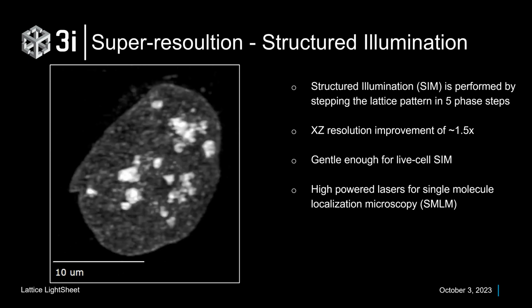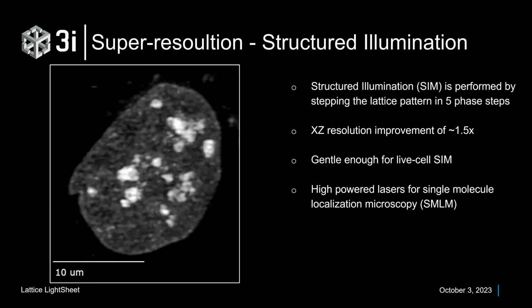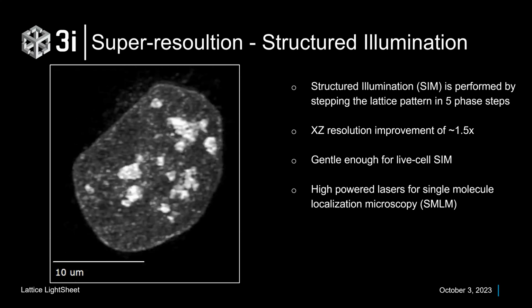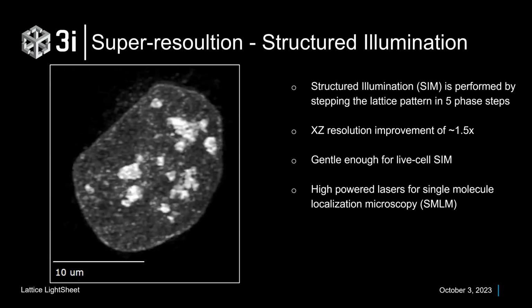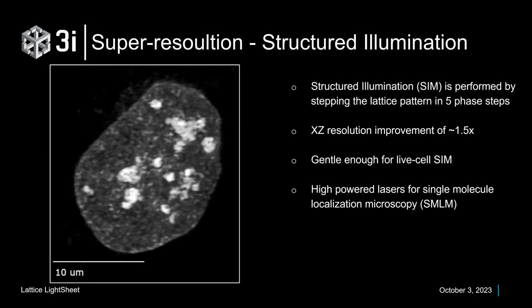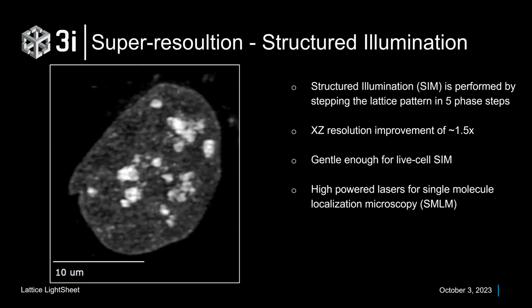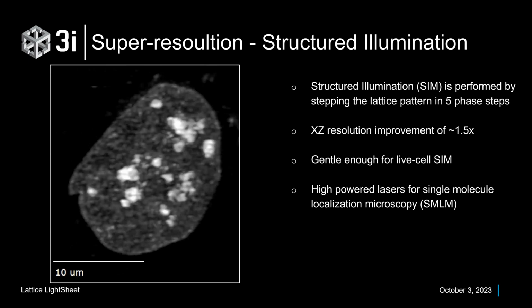Or if you're imaging 3 fluorophores normally, maybe you're cutting that down to 1 or 2 for structured illumination to keep your same volumetric speed. This does require a little bit better signal and noise to process well. So I also like to increase my exposure time or laser power a little bit, leading to a little bit more bleaching or phototoxicity than the normal mode. But again, depending on the fluorophores. So those are the 2 big trade-offs you have to make. It does require generally more excitation light on the sample just because of the 5 images, and usually a little bit more just to get better emission out for the process.